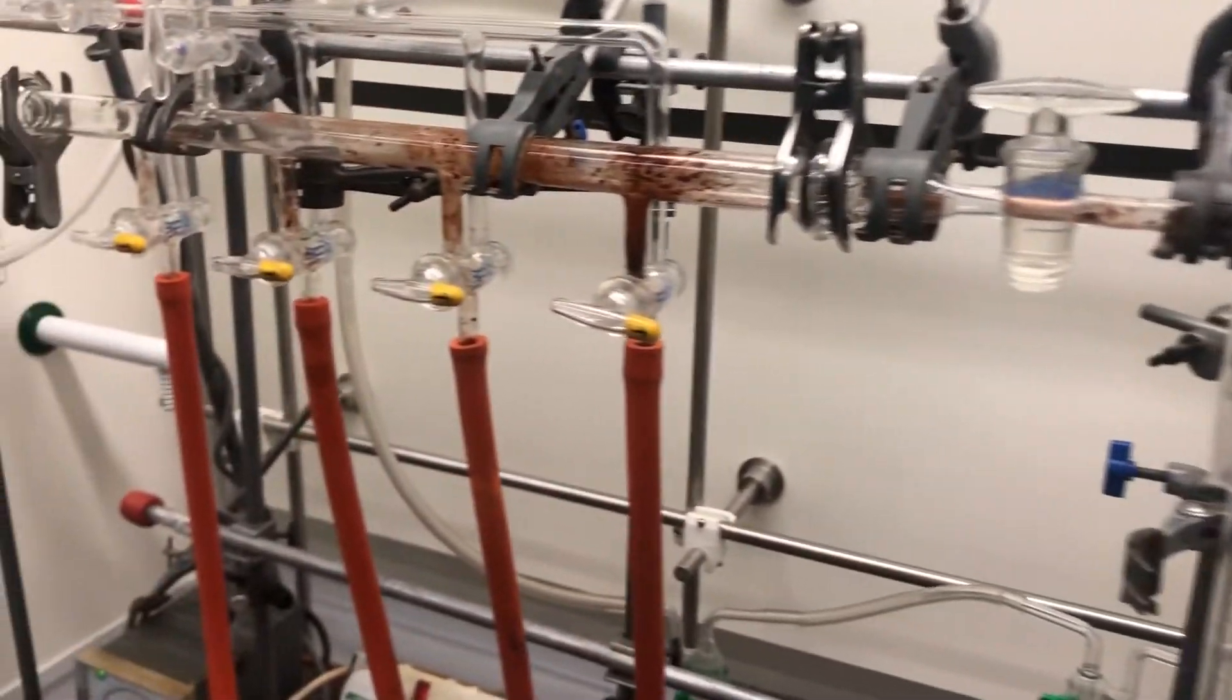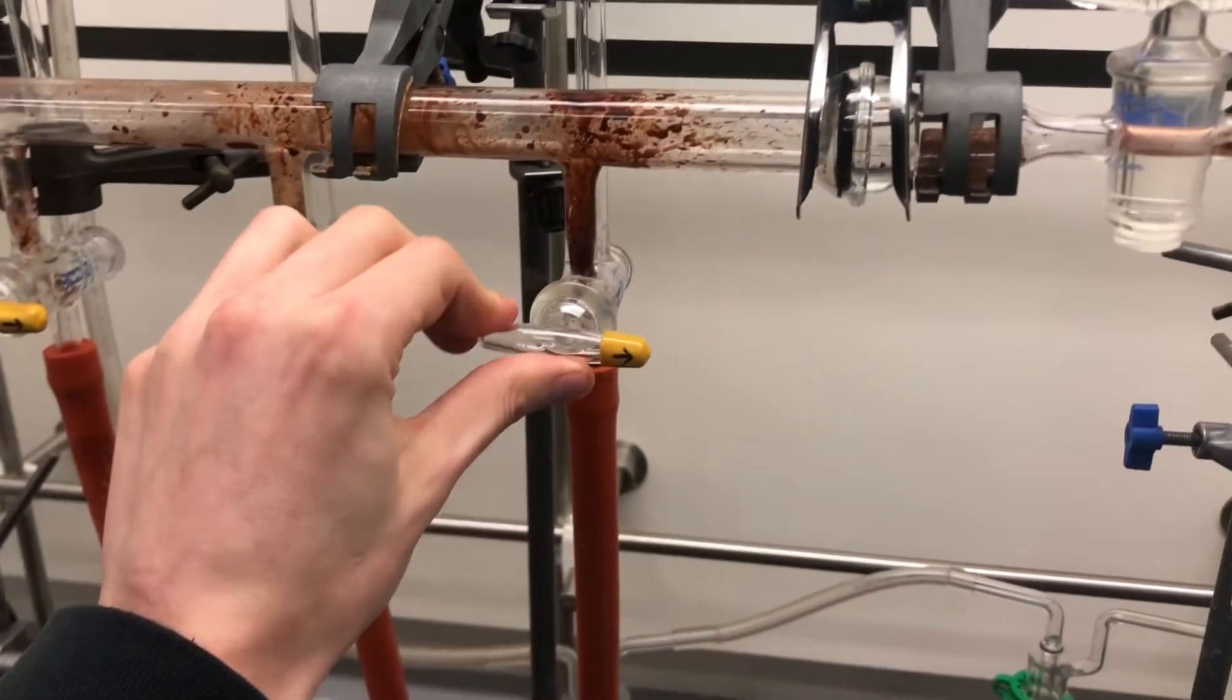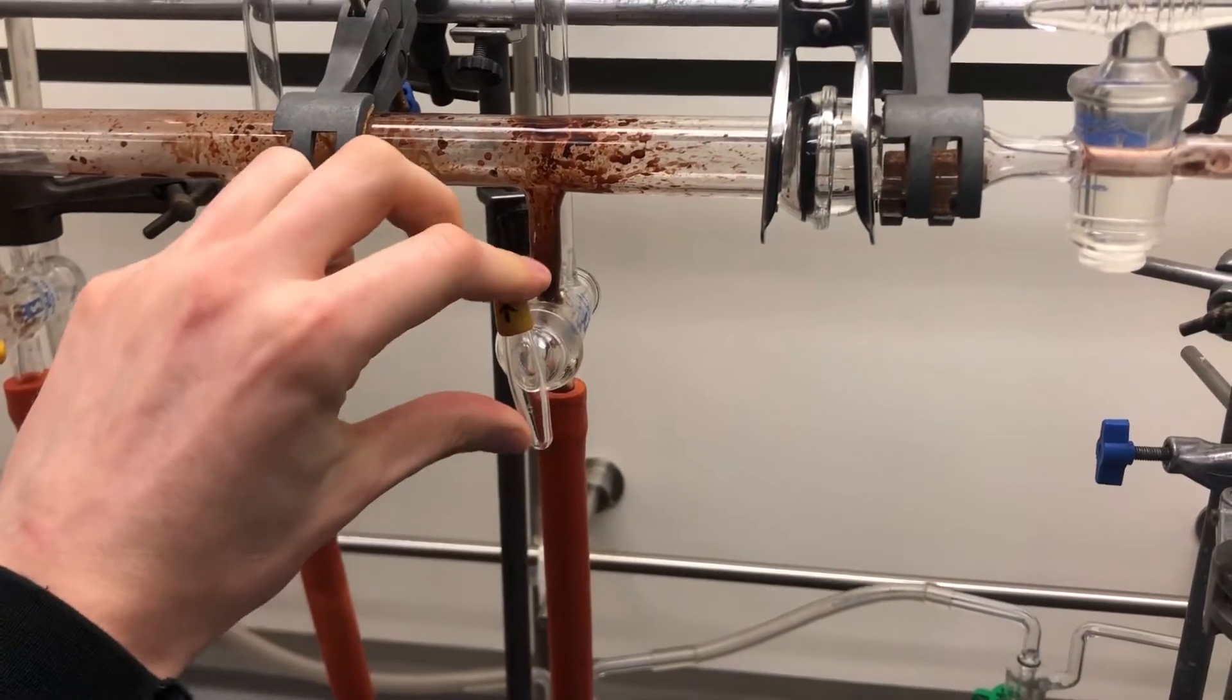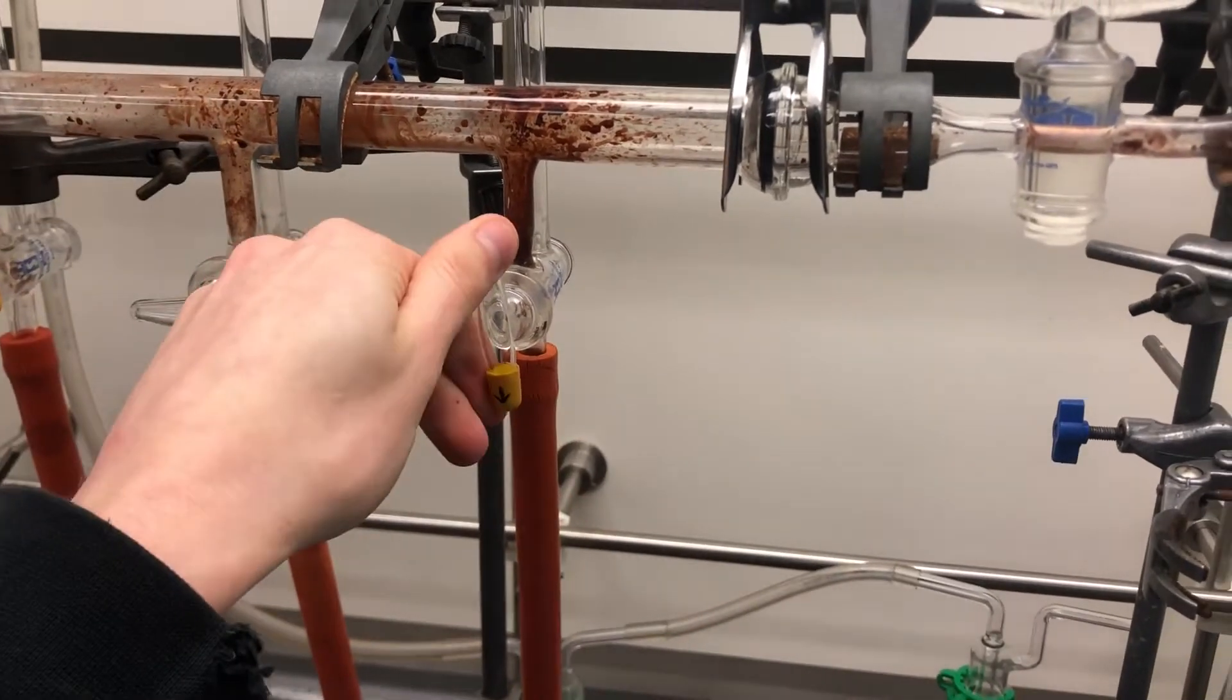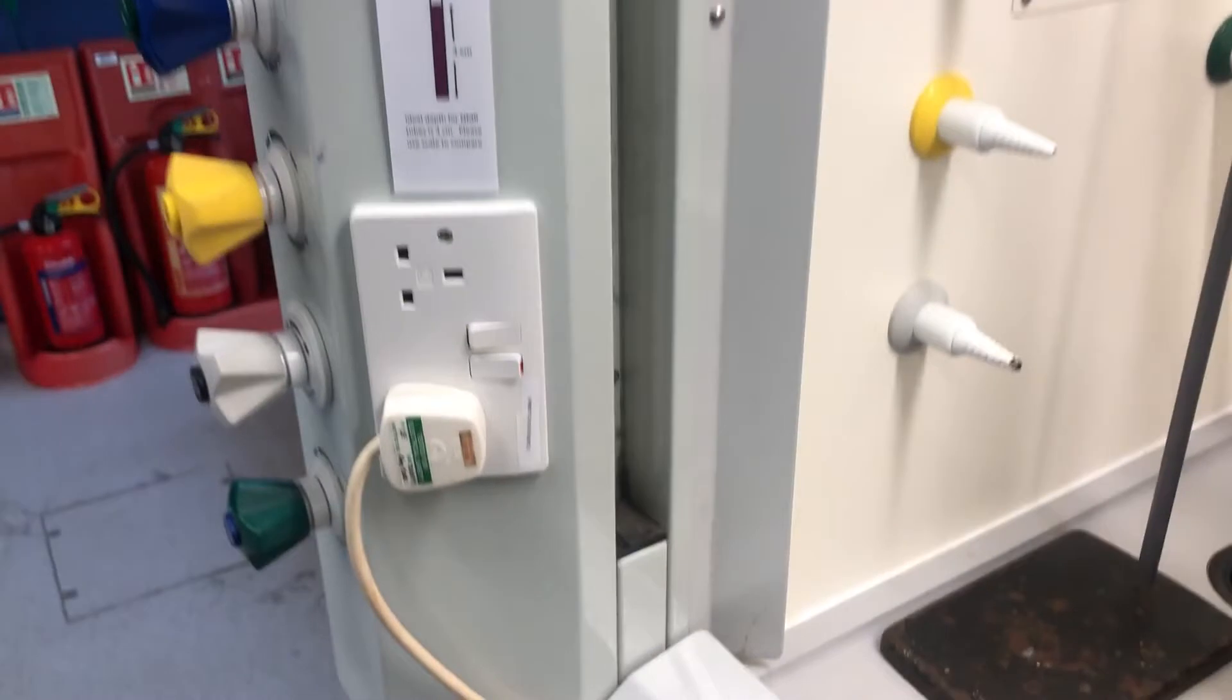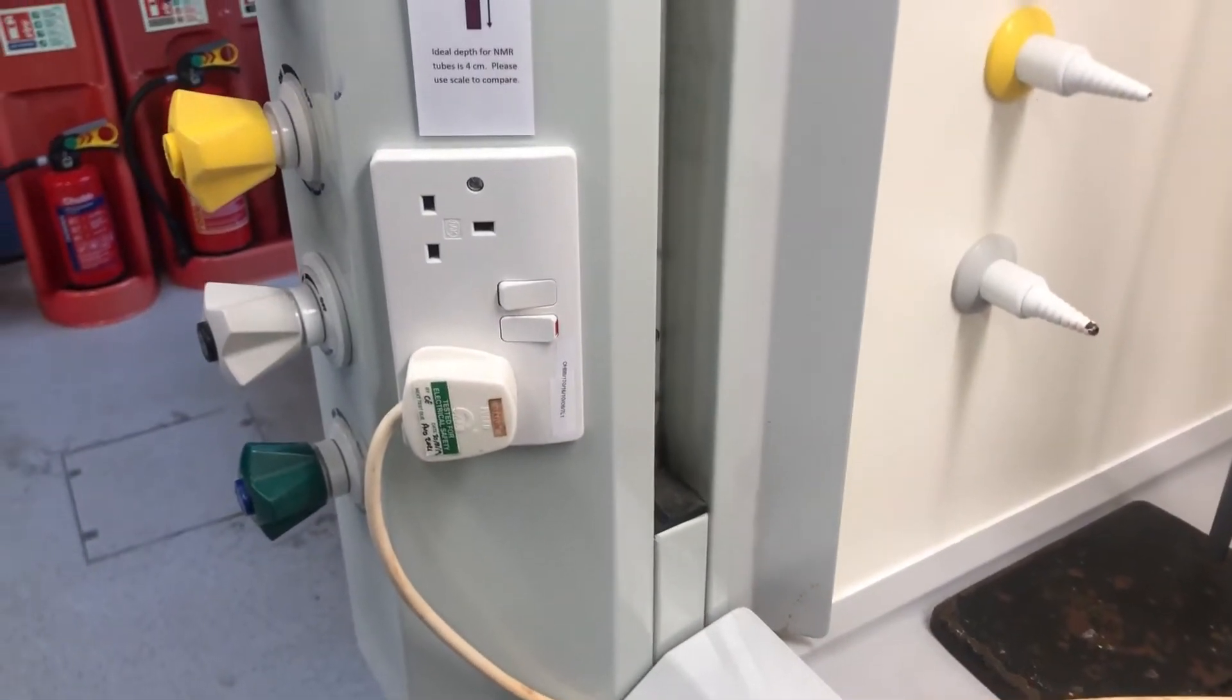All of the hoses that are attached to our system are controlled by these double oblique taps, and the arrow denotes the direction of gas flow and connects either to the vacuum manifold or the nitrogen line, which we can see here.